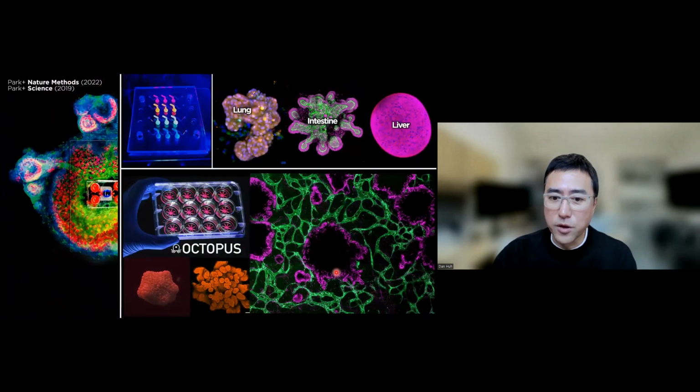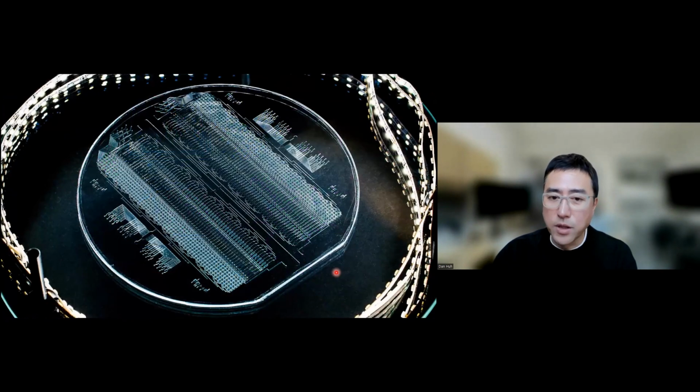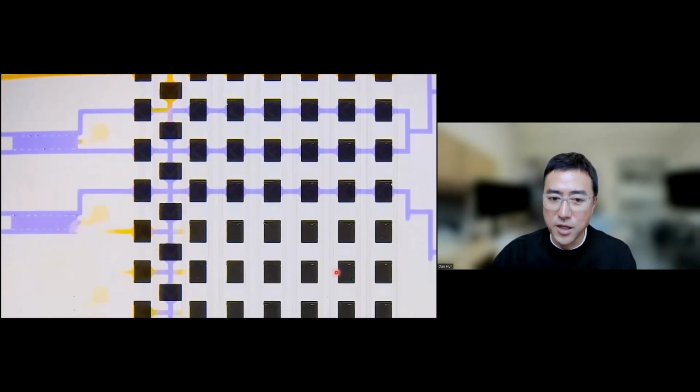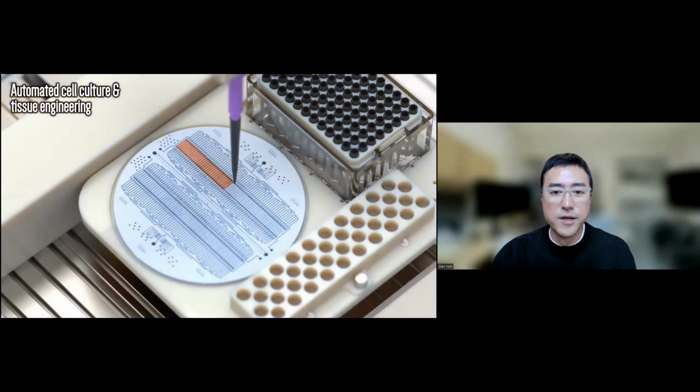We can also use similar designs and techniques to vascularize organoids, for the purposes of creating vascularized, bigger, functionally more mature organoid tissues as well. And most recently, we have also succeeded in scaling up some of these model systems using this platform shown here, containing 256 individually addressable cell culture chambers that can be controlled by a very sophisticated fluidic circuit to scale up the production of tissue and also data acquisition from these model systems.